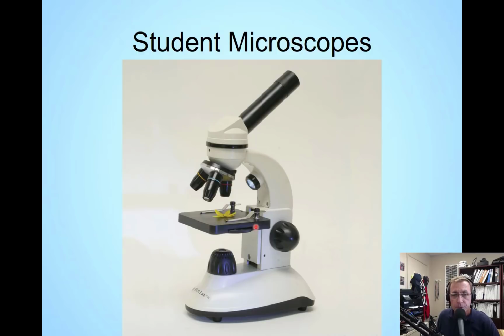Okay, so there's your student microscope. I included it. You'll notice on our student microscope, we have the 3 objective lenses, eyepiece, and so on, the body tube. We've got the arm of the microscope, base, and all those things. And we do only have the one adjustment knob, not coarse and fine, so that's a little bit of a challenge. You've got to be careful.